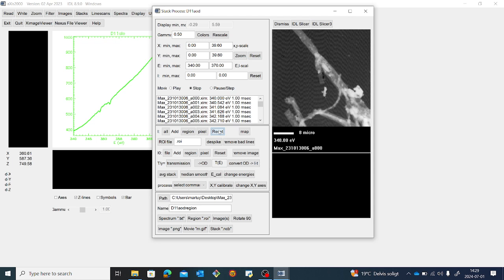So image stack allows you to extract a spectrum either from the entire region or from a specific region or specific pixels. In addition, it can also allow you to extract spectrum from thickness, so you can get thickness-based information. How to do that?